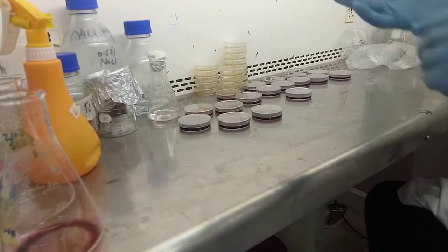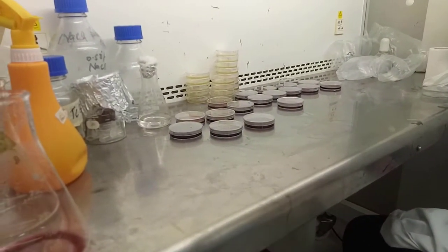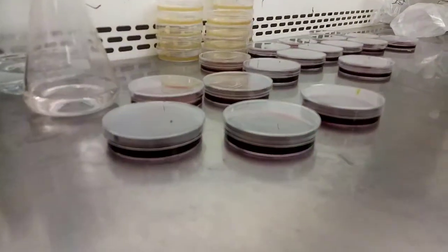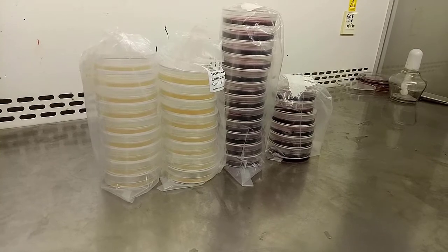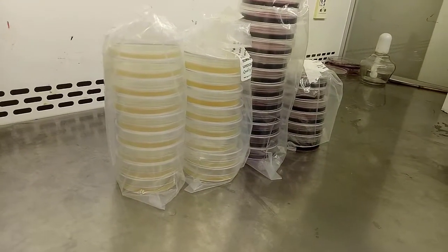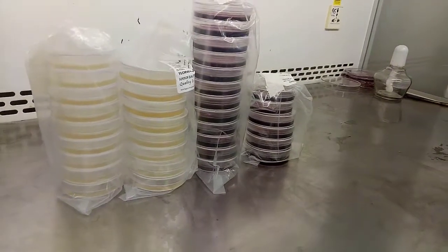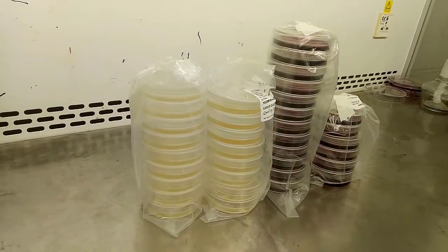After pouring the agar media, we will leave the petri plates for 5 to 10 minutes at room temperature for solidifying. Then wrap the agar plates in aluminum foil or any other cover and store at 4°C in the refrigerator for future use. Thanks.